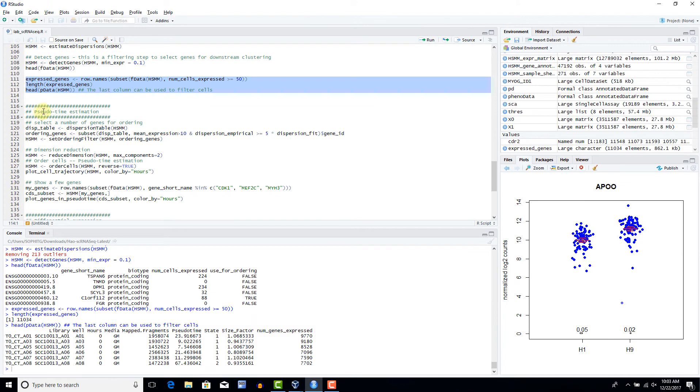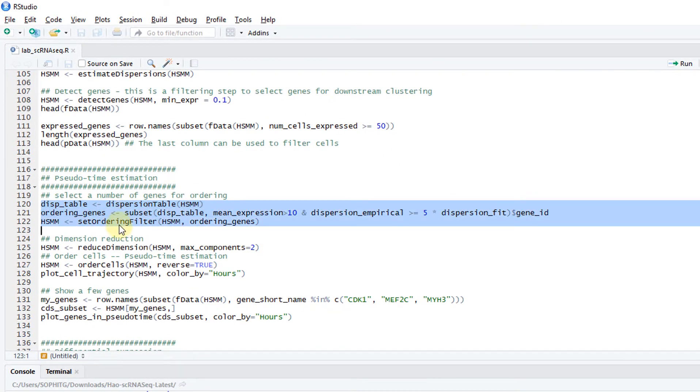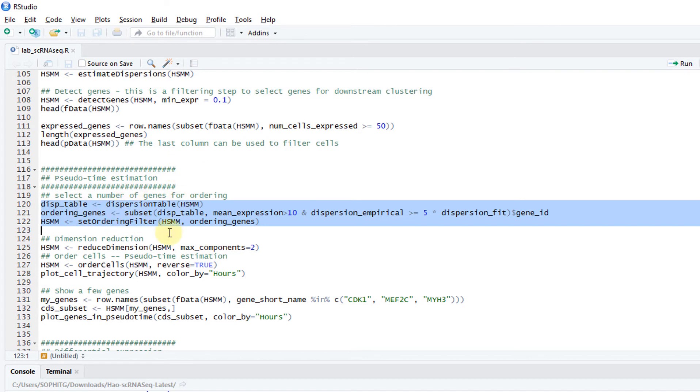When I select the genes, we can do a pseudo-time estimation. The pseudo-time is basically used for when you study, for example, time course data or to study the progression of some diseases or development. You have this bunch of cells. They can be put into a time trajectory.